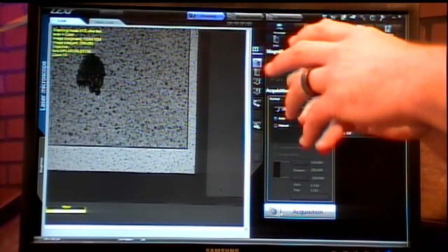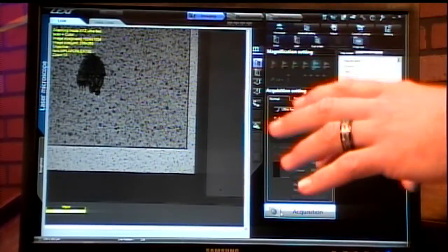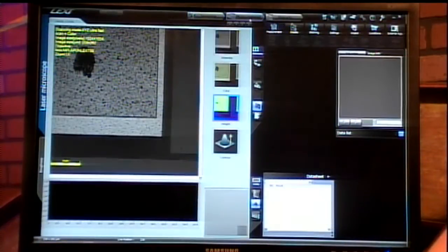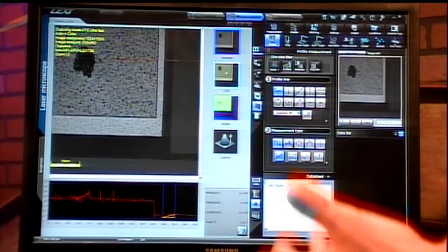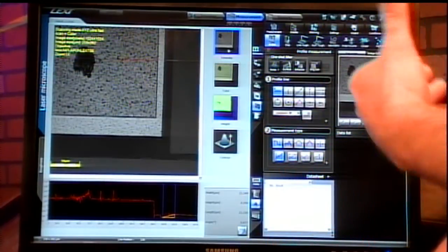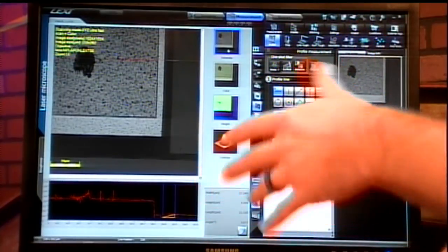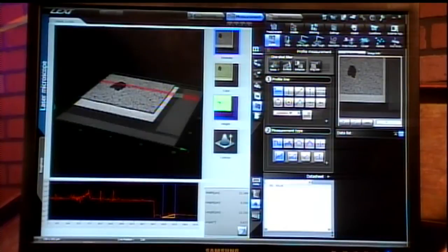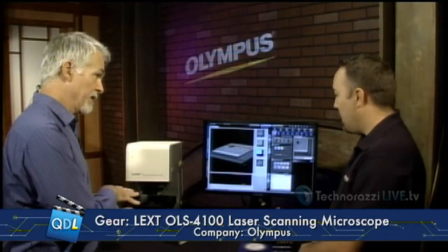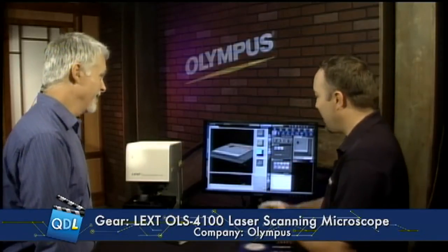So that was a laser scan — it's very quick — and then it goes through and captures a color. Is it scanning the area that you're visually seeing? Yes, the area you're visually seeing. The tool also has the capability to do stitching, so you can set a large region of interest and it'll go through and scan the entire three-dimensional region of interest for stitching. Now that it's done, you'll see it presents a complete and focused image. We can go to the workflow across the top — we have bright-field color imaging, bright-field laser imaging, and we could also select DIC imaging, which is differential interference contrast, bringing out more features on the surface. You can also render in 3D. That was actually a 3D scan, that quick — it went from bottom to top of focus and captured all the data.